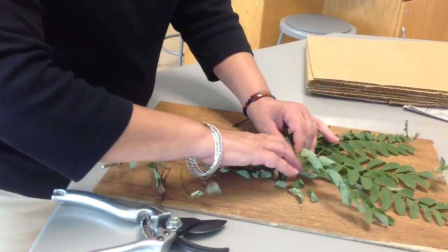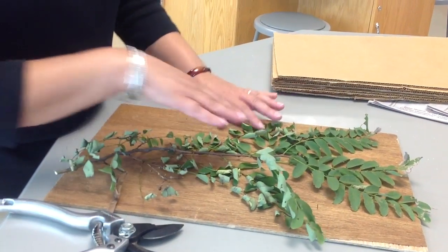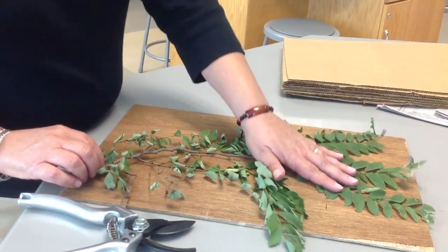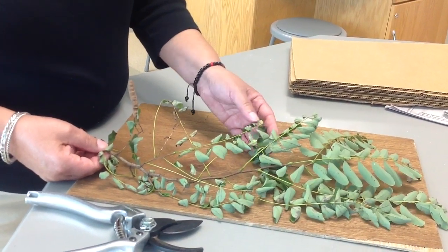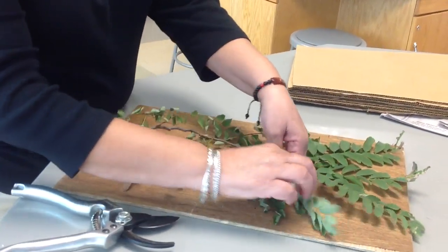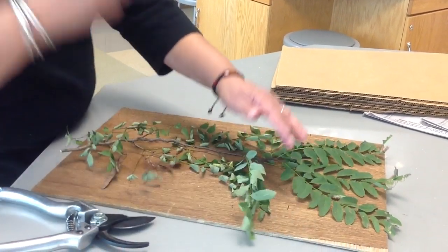I want to try to get my samples to spread out. It's good if you can get both the top of the leaf and the underside, because as you can see on this plant, the top is one color and the bottom is quite different — it's a lot lighter. So when pressing, I'd like to try to preserve both the top and bottom of the leaf.